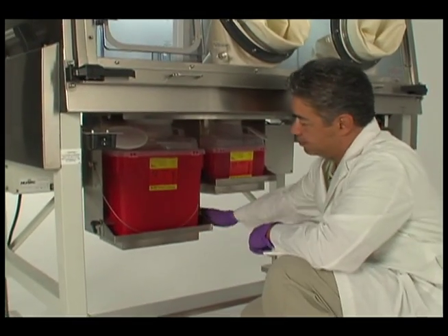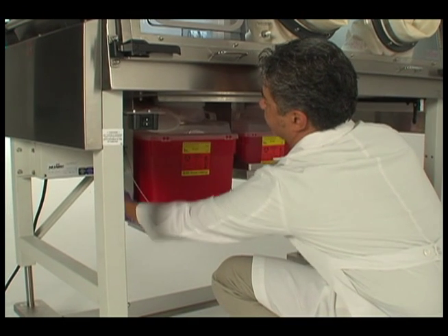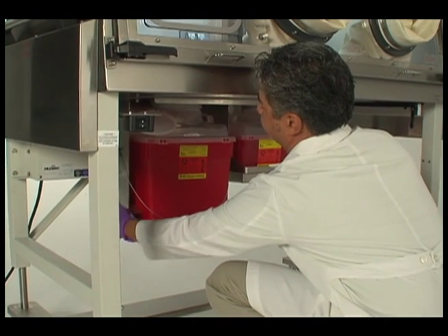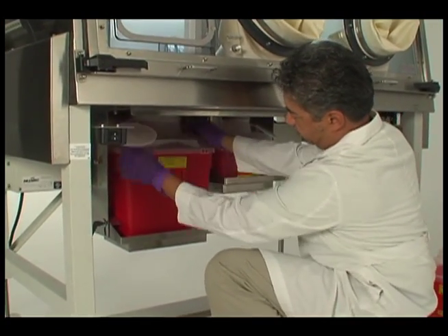Turn the locking handles beneath the isolator counterclockwise to release the container from the waste chute gasket. If this is a sharps container, seal the transport lid and dispose of according to your facility's standard operating procedures.